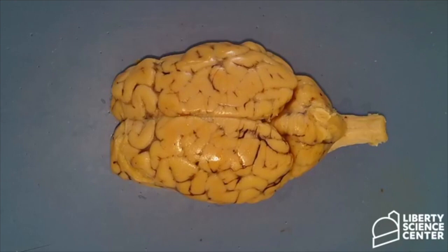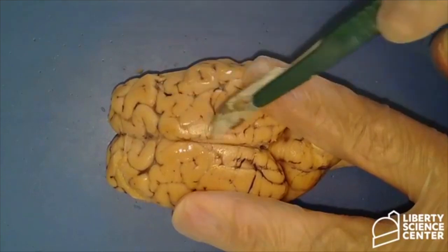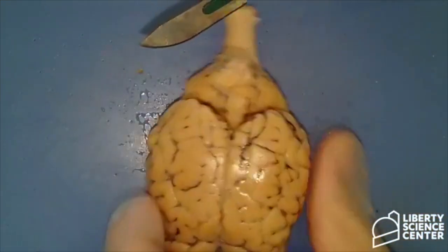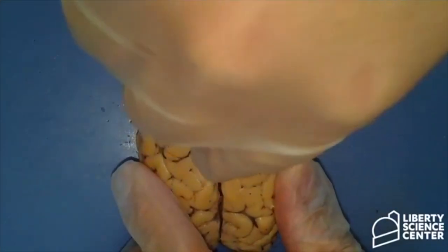All right, so here we go. I'm going to take my scalpel and cut along the longitudinal fissure. It might come off camera a little bit; I just got to situate it so I can cut through. So I'm going to use the longitudinal fissure to perform the incision, to perform that cut.